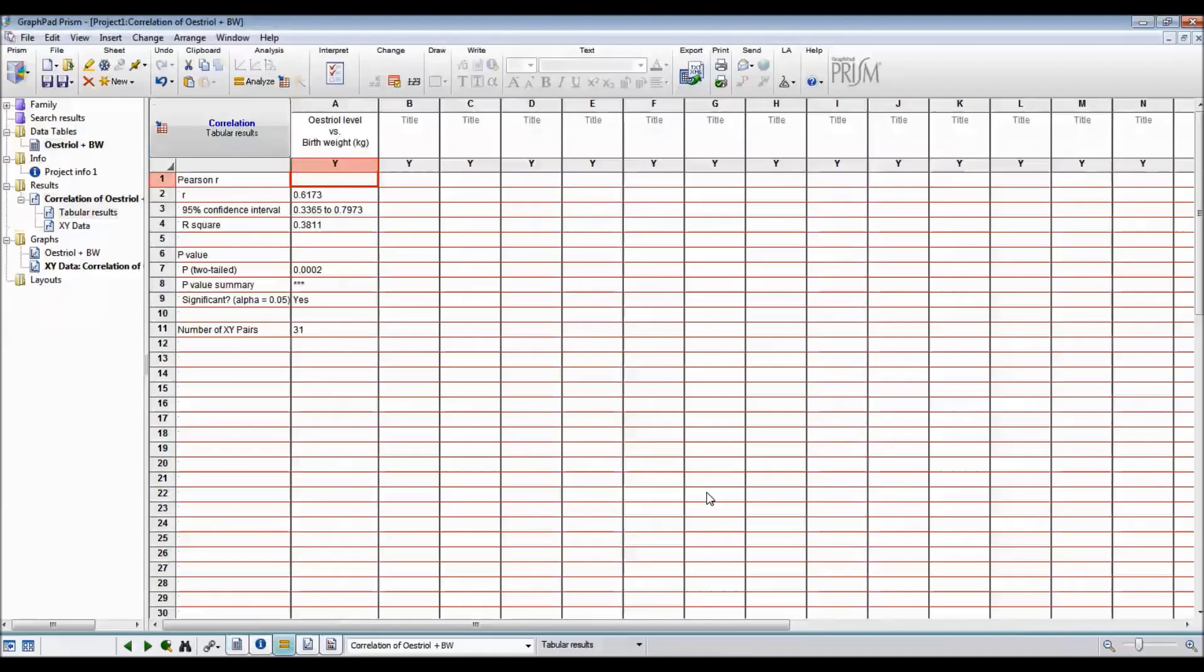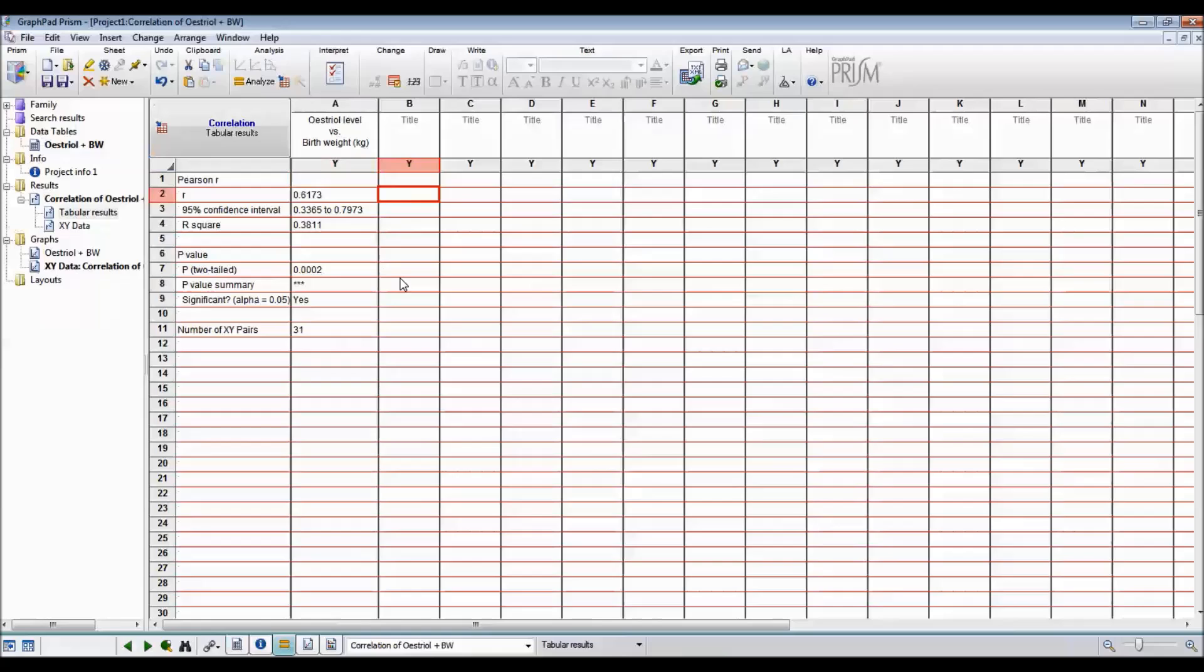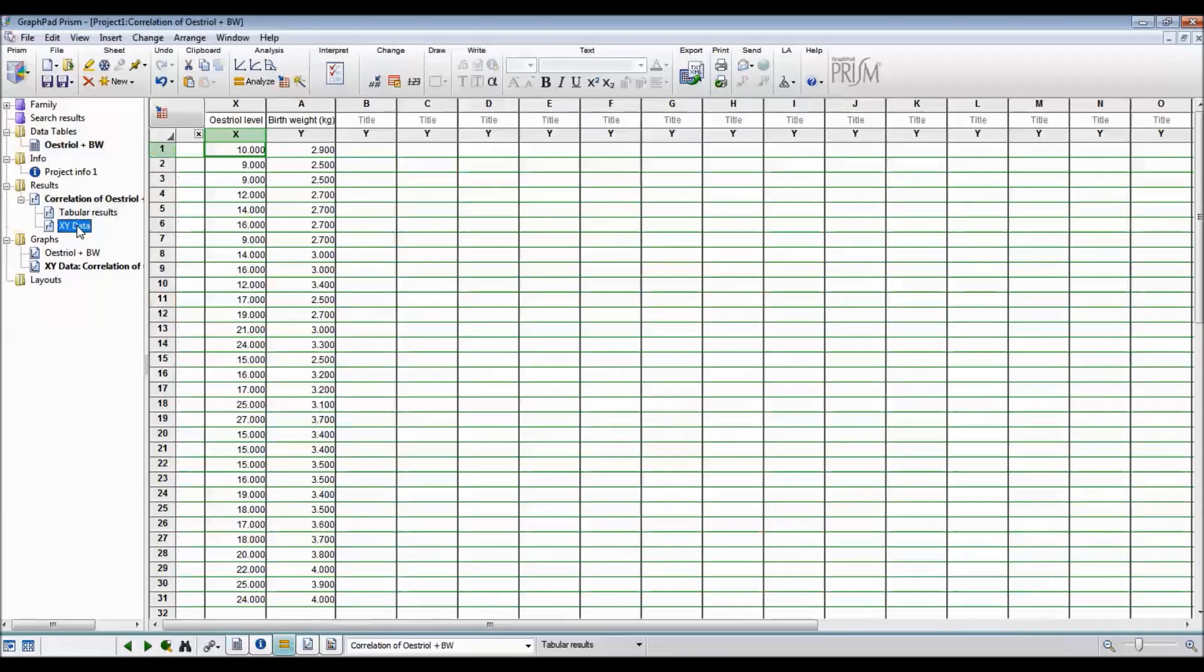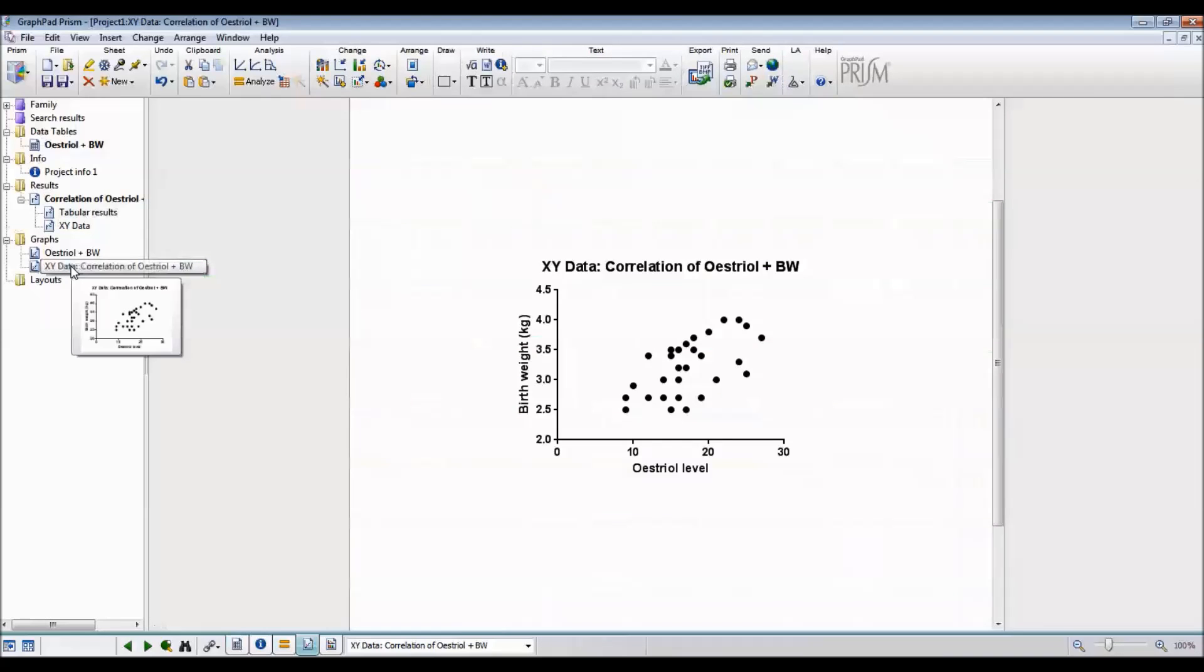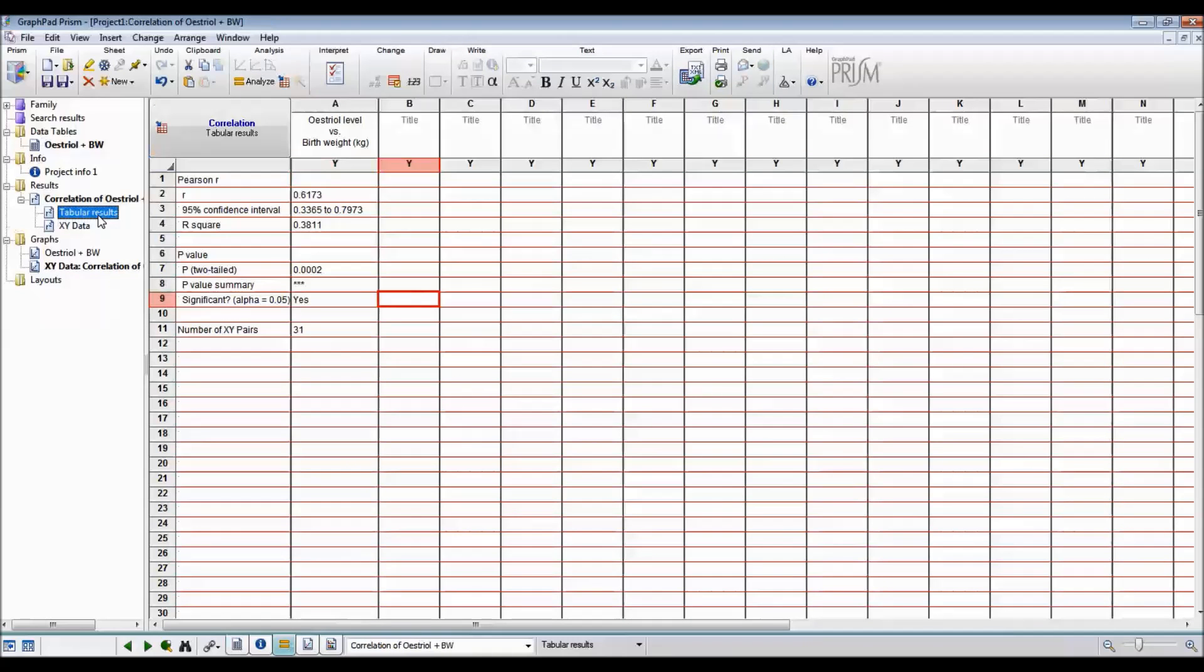So this shows you that the R value, the correlation coefficient, is 0.6173 with a 95% confidence interval. We'll cover the R squared value later. And the P value is 0.0002. So three zeros and then a 2. So that means that it is significant. The null hypothesis of the correlation coefficient being 0 is incorrect. The alternate hypothesis of the correlation coefficient not being 0 is what is correct. You can also look at the XY data, which is the same as before. And you can look at the correlation, which again is the same as before. So we only need to look at the tabular results.